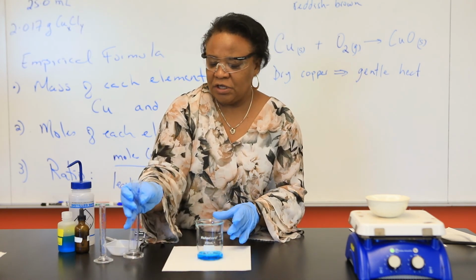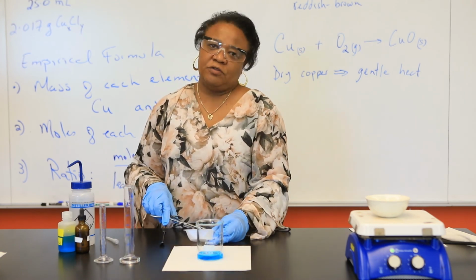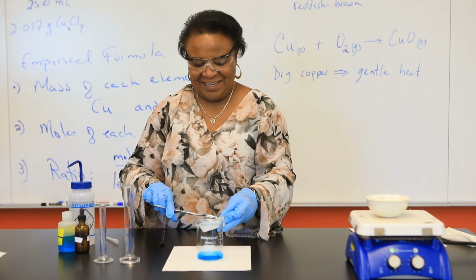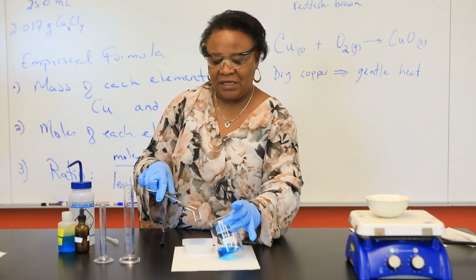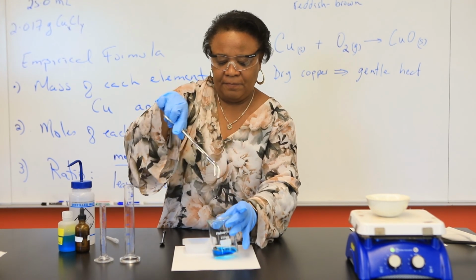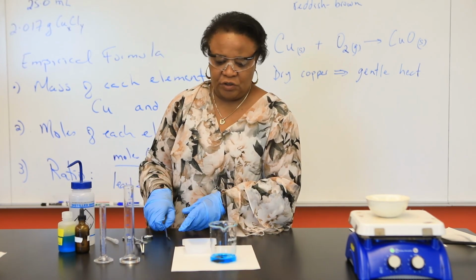Okay, now that the transfer is complete, by means of a spatula. So I'm using tongs. I'm going to be transferring my solid slowly, quite slowly. My goal here is to make sure that I avoid any splattering to my beaker. You'll also note that that zinc metal was what, a clear colorless solution.